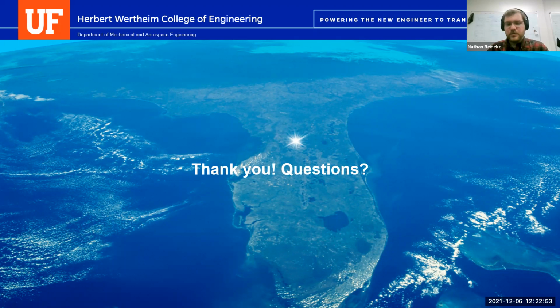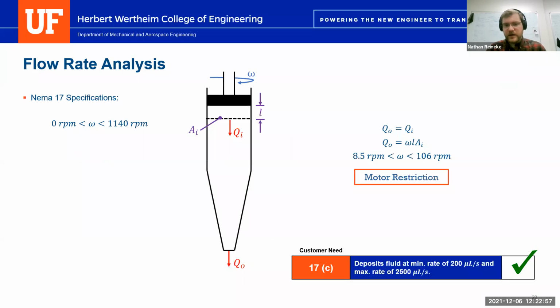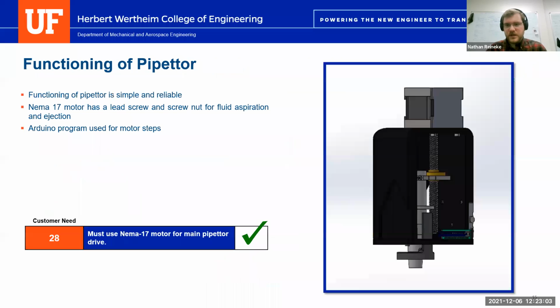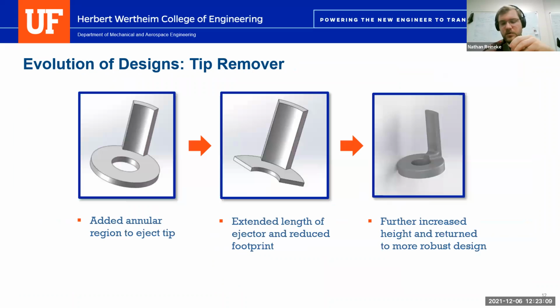So that's 3D printed. We actually found that it was really fast 3D printing. It took about 10 minutes to actually 3D print the tip remover, and it's quite robust. It's this plastic part right here that you'll see. And when you physically have it in your hand, it has very little give. But honestly, I think we're just 3D printing, keep it consistent with 3D printing.